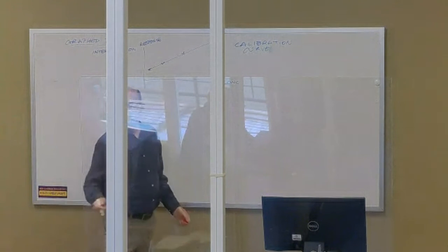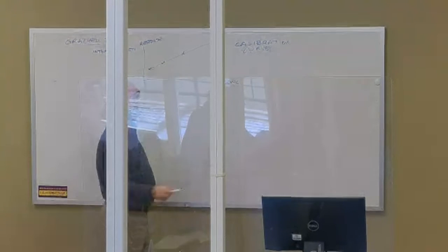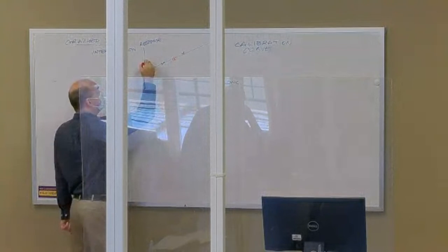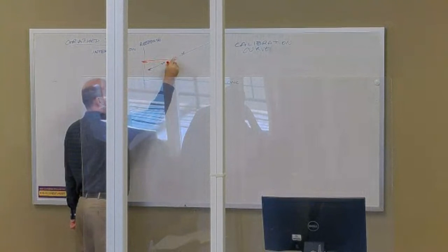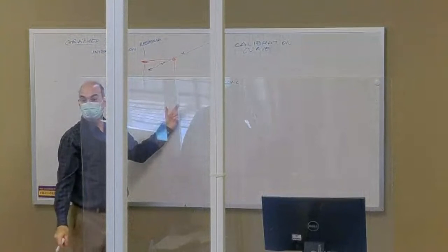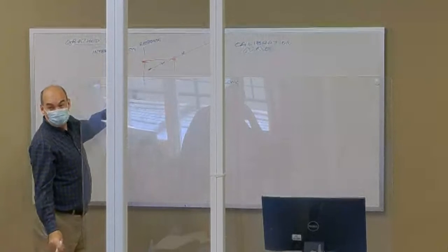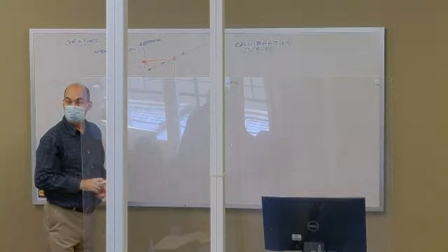And then you take your sample and you measure it. Your sample is there. It gives this response, and you measure across and down. And that's your concentration. That's interpolation, because your data point is inside of the data set created by the calibration curve.